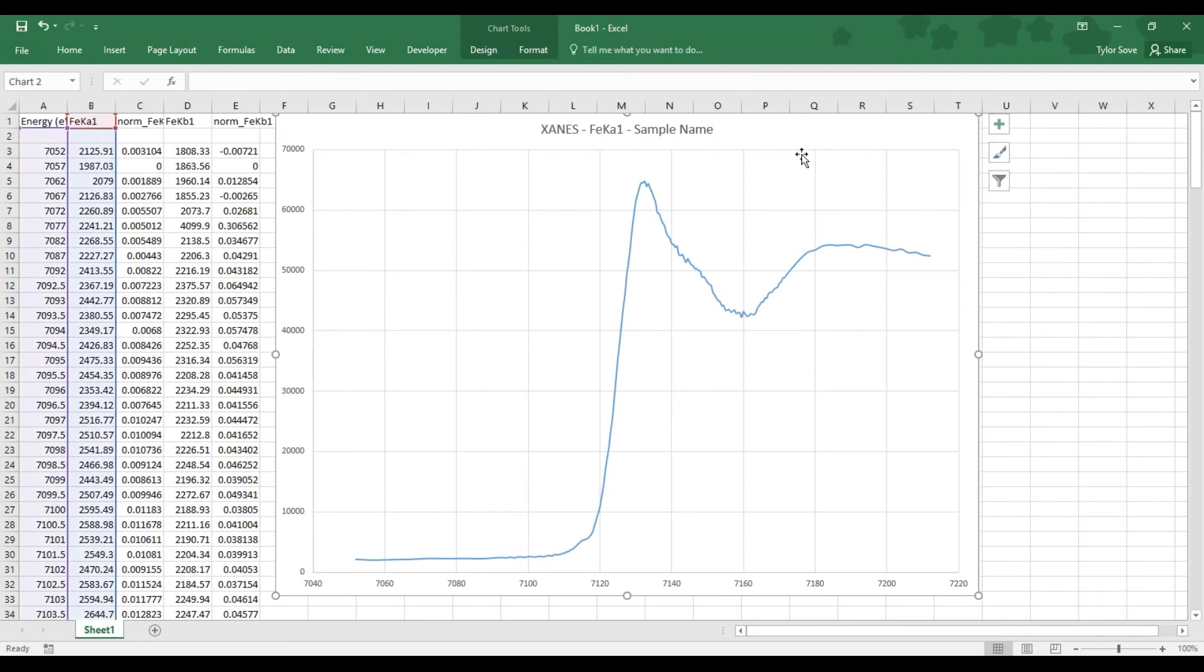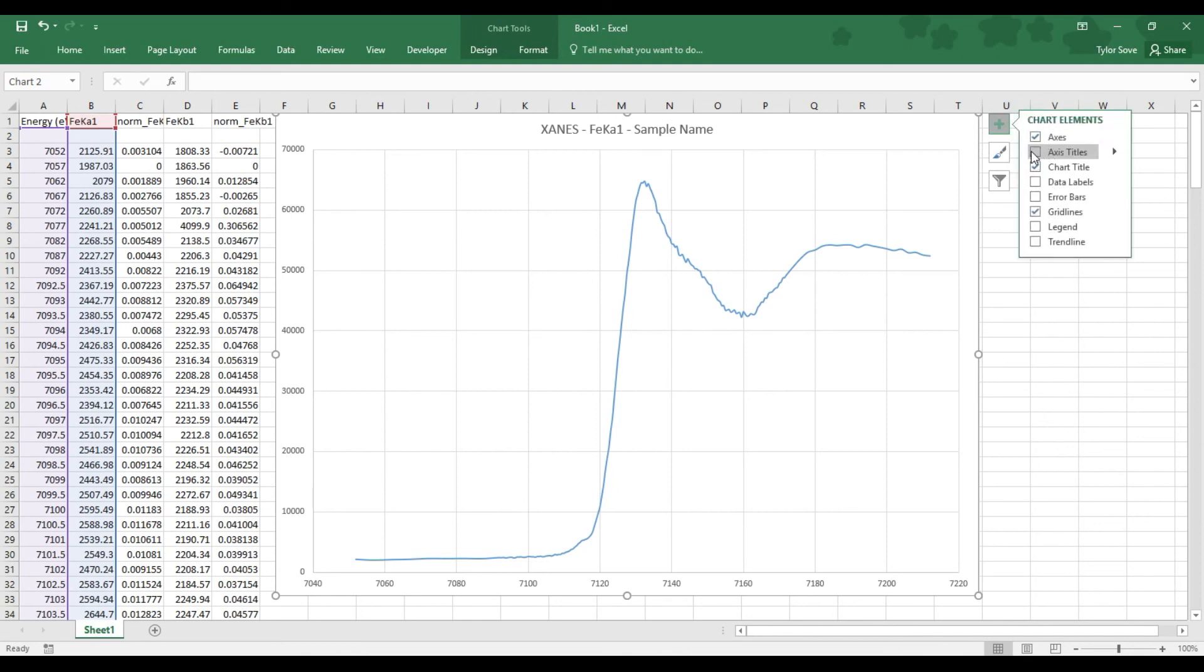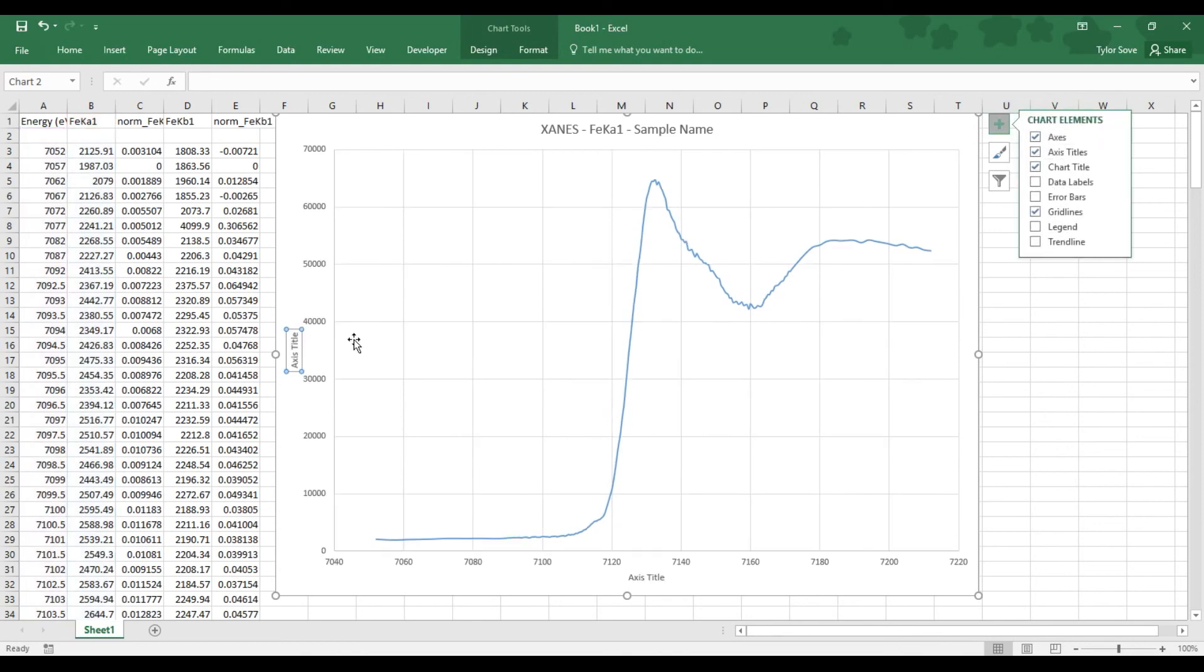Now the other thing that we're missing are axis titles, because right now these axes are meaningless without it. And so to provide the titles, go up to the top right over here to this chart elements and select the axis titles option.